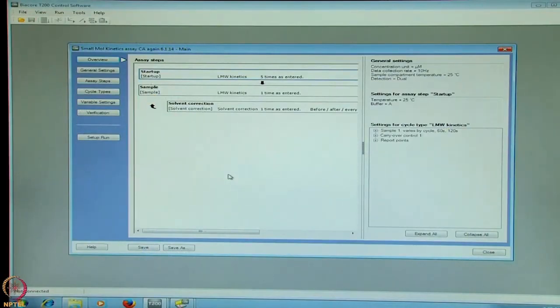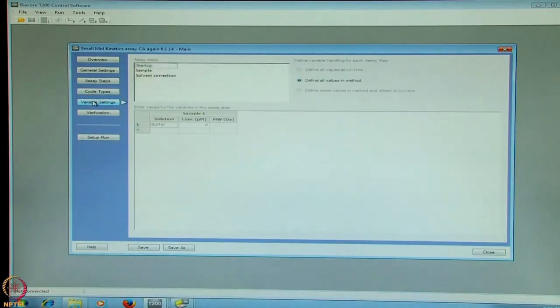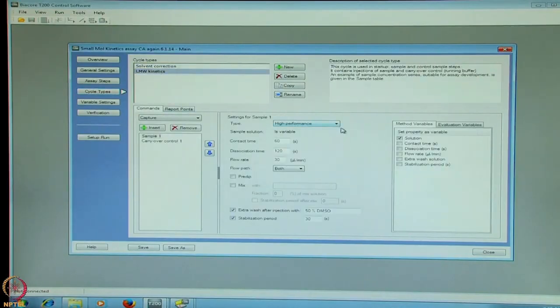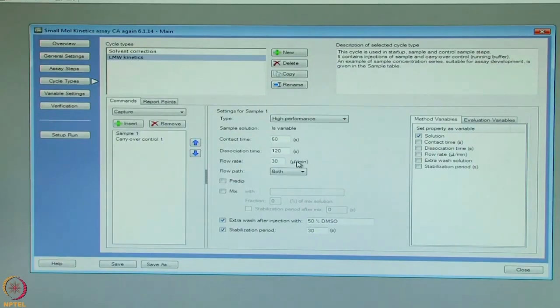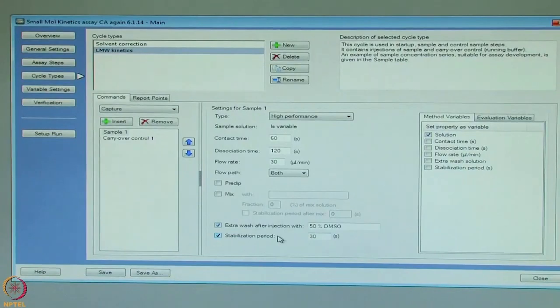We now see how a small molecule kinetic template is set up. Similarly, here as well we have the startup, we have a sample flown at least once on the surface and a solvent correction with 8 different solvent correction points set here. Here also in the variable setting or in the cycle type, we go to the low molecular weight kinetic wizard. Check that the type is high performance. Contact time is 60 seconds. Dissociation time is 120 seconds. Flow rate at 30 microlitre per minute. Flow path both. So, extra wash with 50% DMSO. Stabilization time of 30 seconds is provided here.